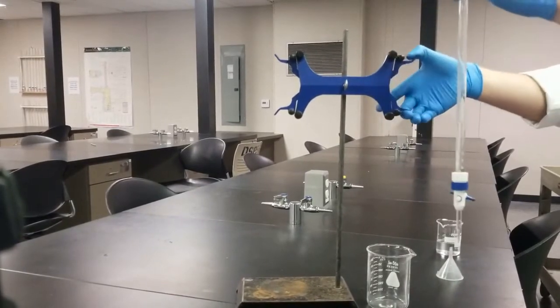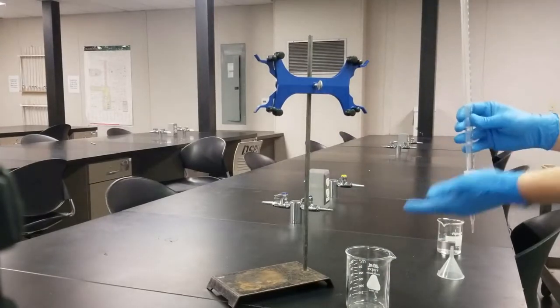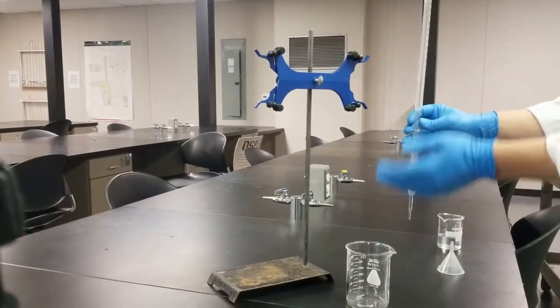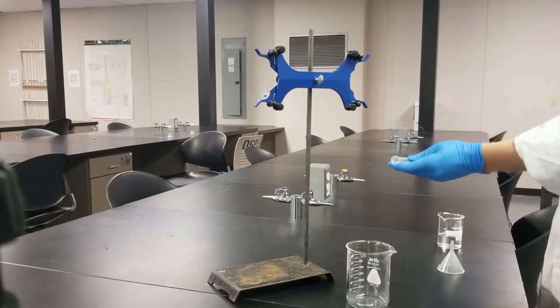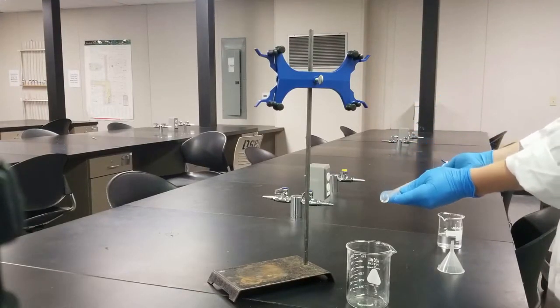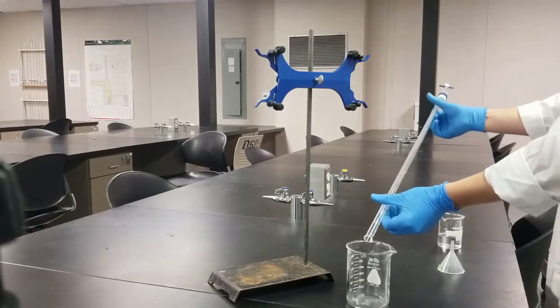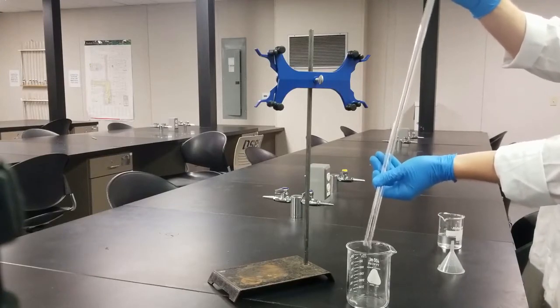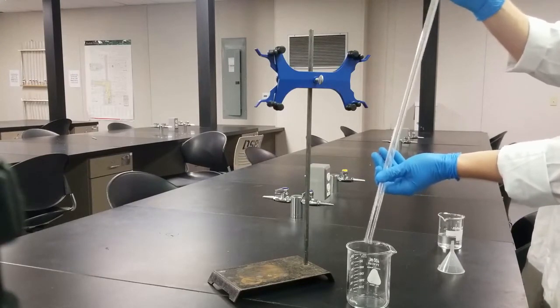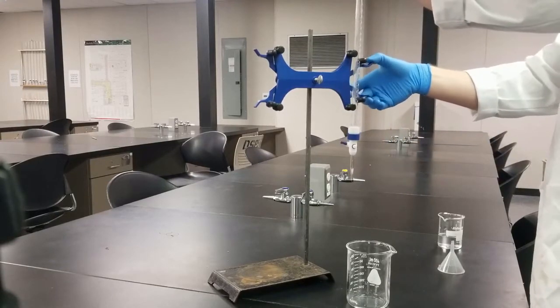So I'm going to take the burette off of here, and I'm simply going to pour the silver acetate back into my waste container. And while I'm doing that, I'm going to give it a swirl. That way the silver acetate touches all of the burette. So pour it in here and just give it a nice swirl through. There we go. Now we've conditioned our burette, and every liquid in here is our solution of silver acetate.